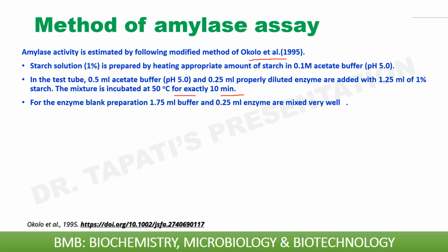So in order to subtract the sugar content in the enzyme, we are taking this value of absorbance for the sugar content present in the enzyme sample.